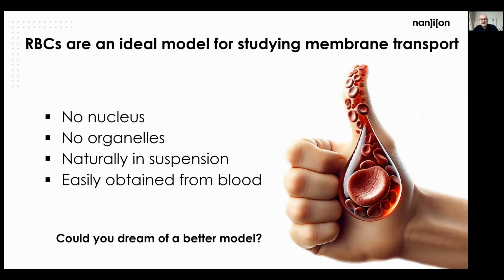And why is that? Because these cells have no nucleus, no organelles, so no contamination from inside. They are naturally in suspension, so we don't need any mechanical or enzymatic digestion for putting them in suspension, and they are very easily obtained from the blood. So obviously, we can hardly think and dream of a better model.